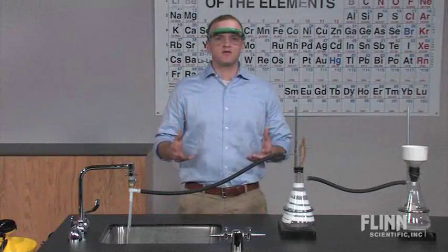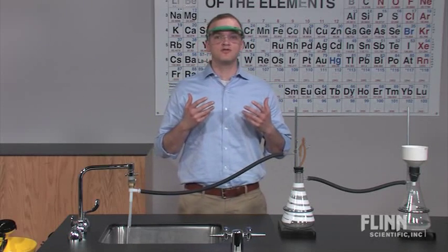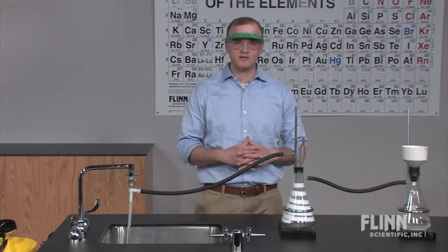Don't eliminate experiments that require slow gravity filtrations. Instead, speed up the process and allow your students to do more chemistry and less waiting by following these simple steps for using a water aspirator.